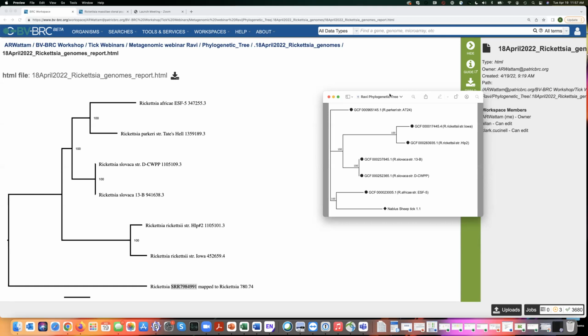I guess that's a more general question when you're selecting genomes. I would first select genomes that are good quality. Another thing I would select, if I was making a tree, is reference or representative genomes. These are the GenBank gold standard genomes that they have established. So they're generally good quality data to look at, and then you can just branch out.